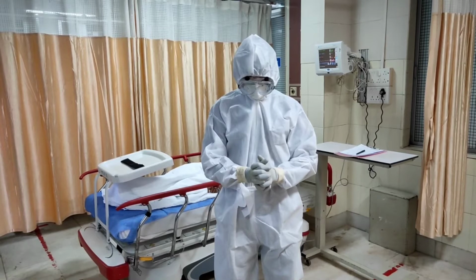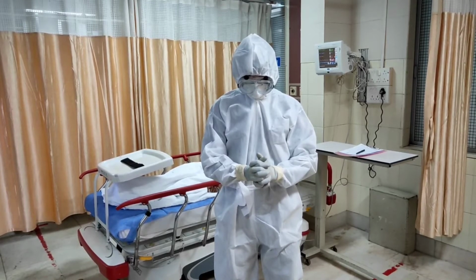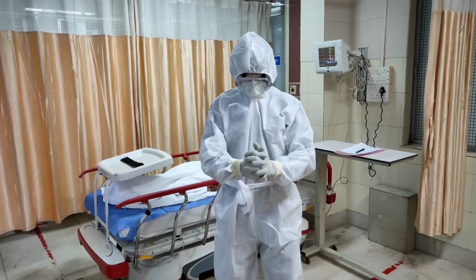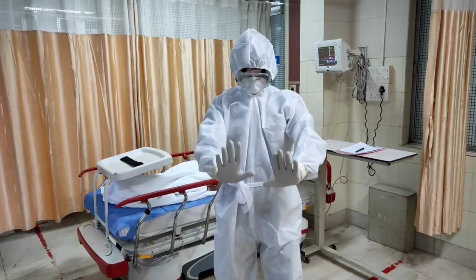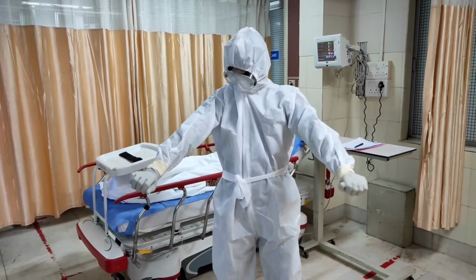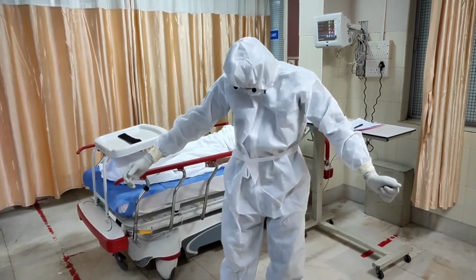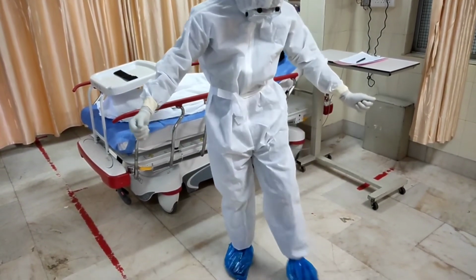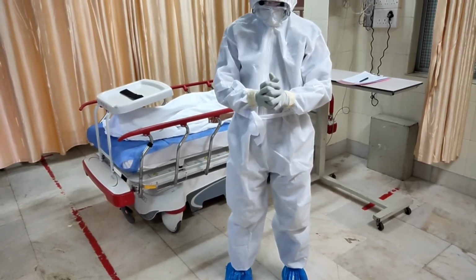Make sure your PPE is safe and is not damaged. You can start with your gloves. Look at the inside and outside of the gloves. Look carefully whether any tears are there and the inside gloves can be seen outside. And also look all over your PPE for any signs of tear, spillage or damages.